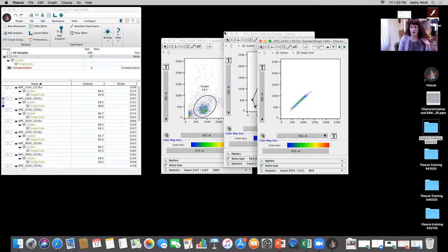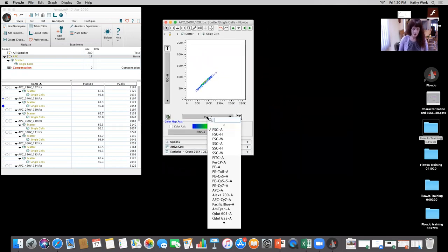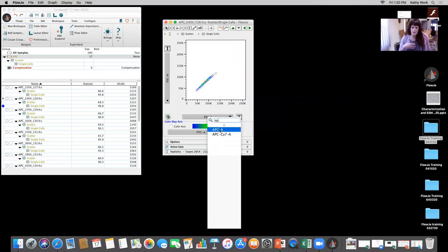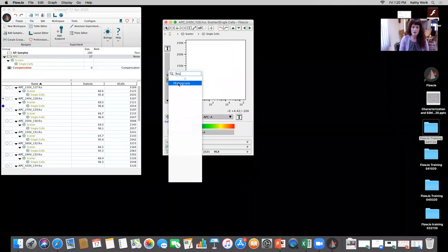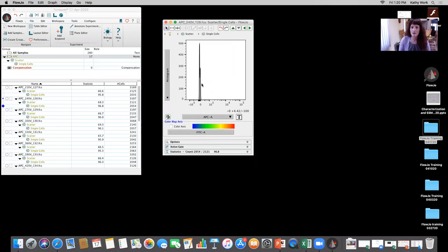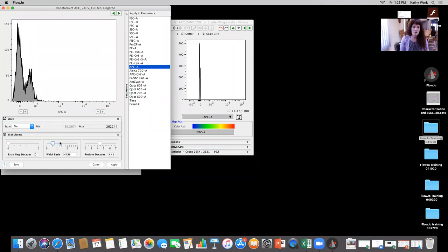Using the right arrow key with the shift key held, both plots now change to the next file, the 240 volts sample. I toggle through quickly just to make sure all my gating is correct. From there, I double click on the single cell gate. I can delete the scatter plots since I don't need them anymore. Now I need to look at my voltage walkup from 210 in increments of 30 up until the APC was off scale. There are two different ways of doing this — via histogram or dot plot.